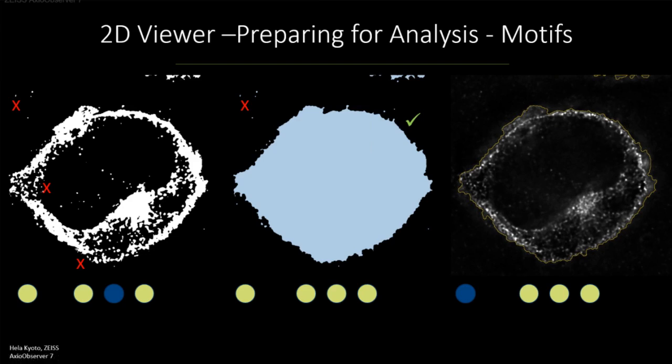And motifs, for me, these are just little combinations of operations that work in certain cases. And I'm still learning motifs. Every week I sit down with a customer and we're discovering some new analysis motif that we can apply to other images. And here's a case where I would use quite a simple motif.